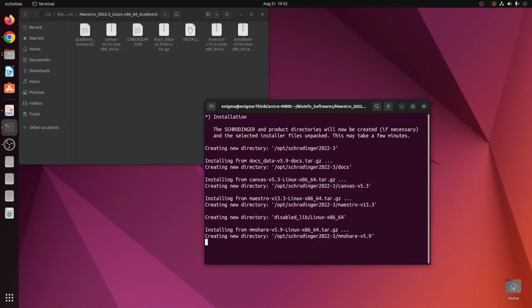Otherwise you can prepare the ligands in Windows. You can also prepare your protein in Windows, but when it comes to the last stage where you prepare the grid and hit enter for docking, it will not do it. It will show you an error, and therefore we are performing the entire experiment, the entire tutorial, in Linux. Similarly for Maestro, the free version is available for Windows as well, and it works pretty well in Windows. So it does not matter whether you take the entire folder and start working in Windows or you keep working in Linux. It's up to your choice, right?